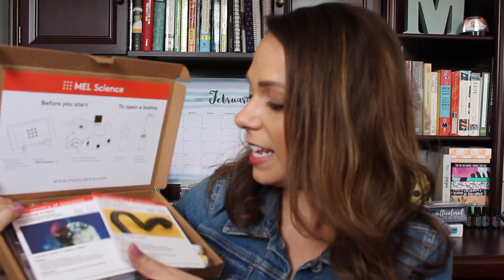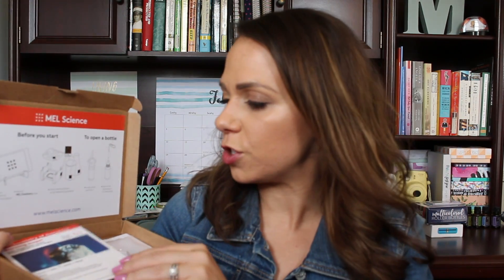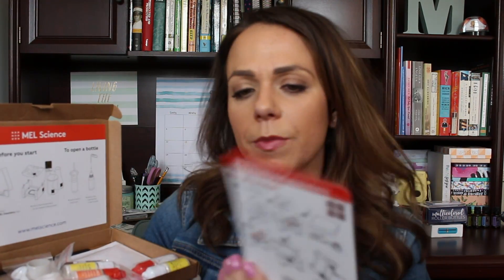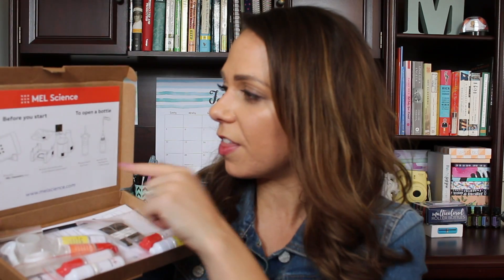The second kit is called 'Chemistry of Monsters' — I thought this one looked really cool too. In here you can make a sugar snake, which I saw on their Facebook page — it looks really cool, like a monster, or honestly kind of like poop. There are more instructions on the back of the little cards. The other experiment is burning sugar — it says sugar doesn't burn easily, simply add ash to set it alight. You get little vials, bottles, and stirring tools.